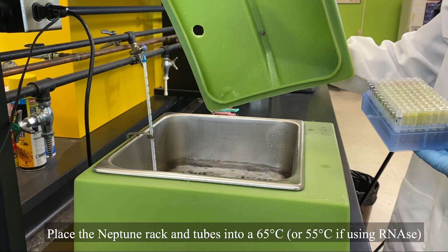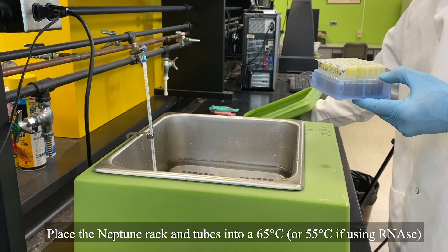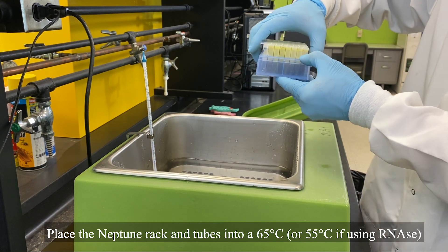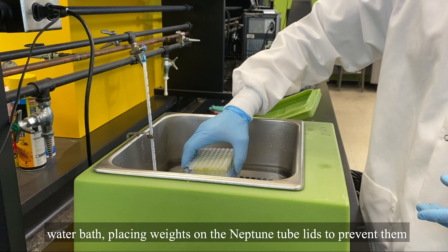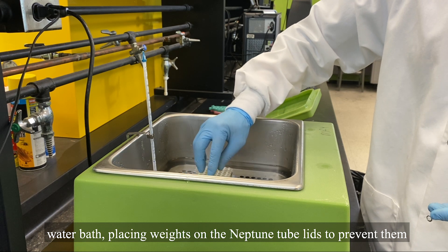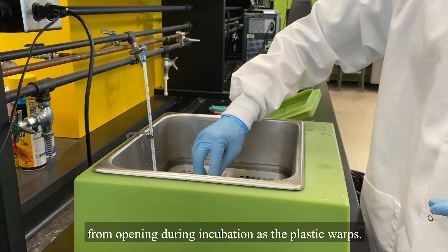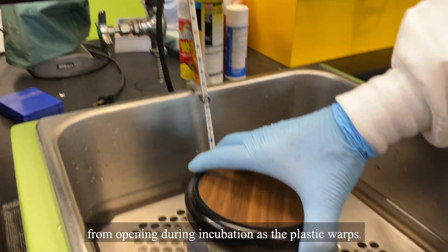Place the Neptune rack and tubes into a 65-degree Celsius or 55-degree Celsius, if using RNase, water bath. Placing weights on the Neptune tube lids to prevent them from opening during incubation as the plastic warps.